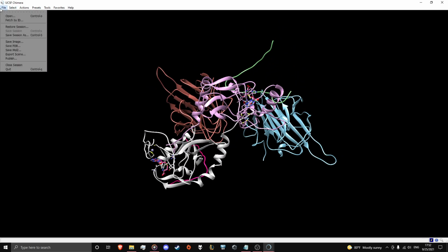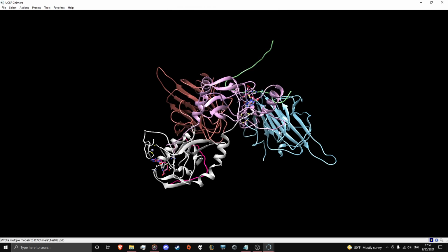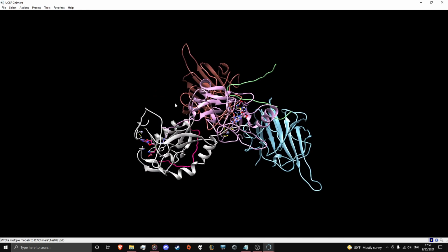So from here, we're going to save it as PDB, and we're just gonna give it a name, and from there it should be complete.